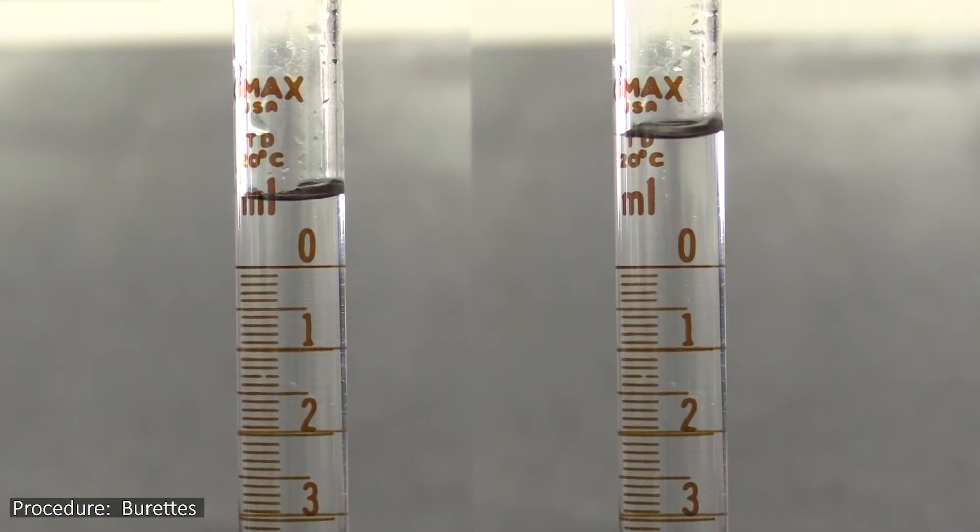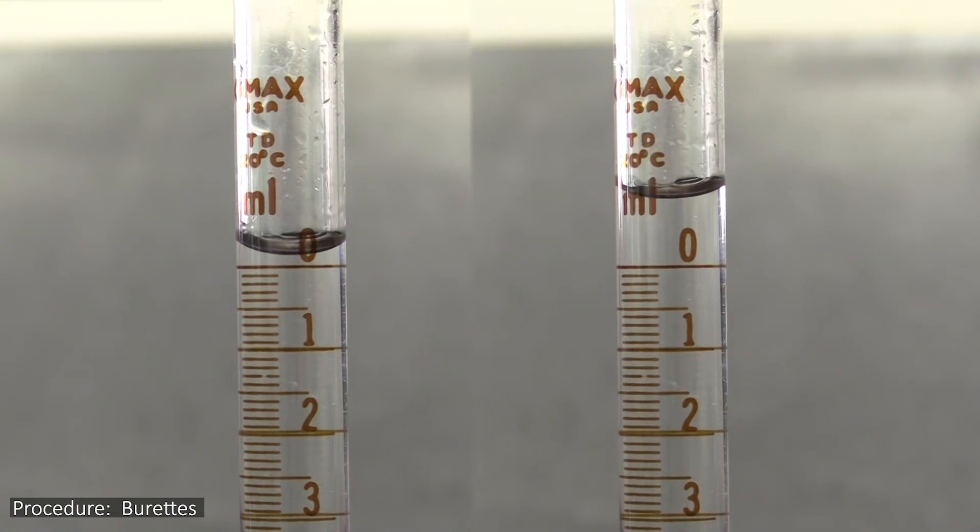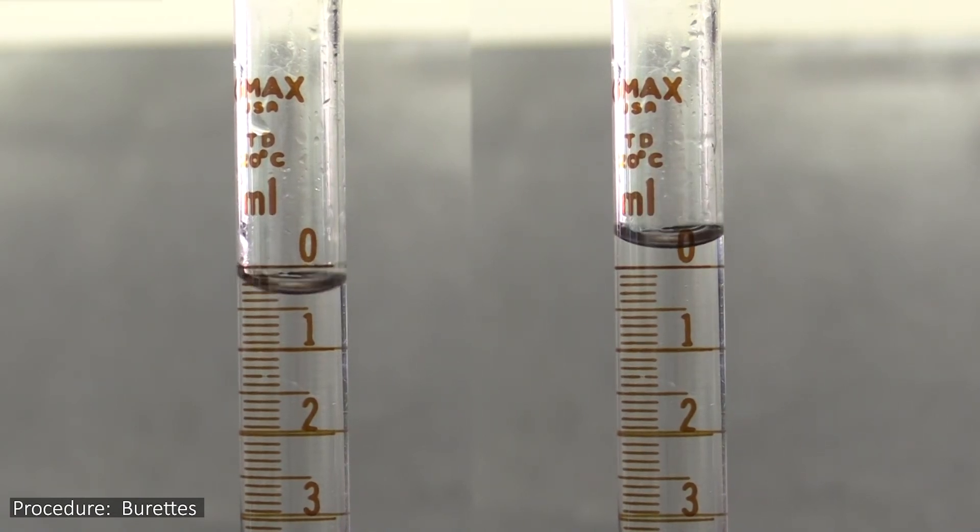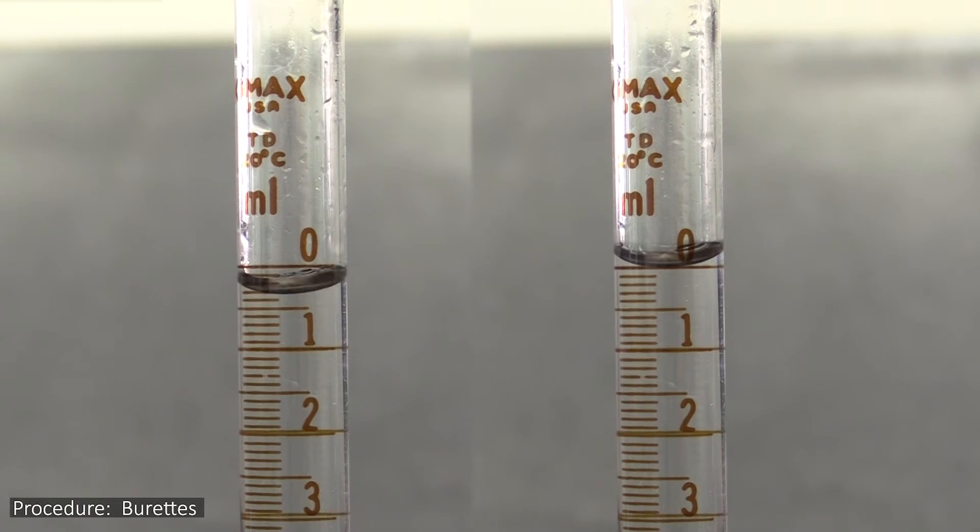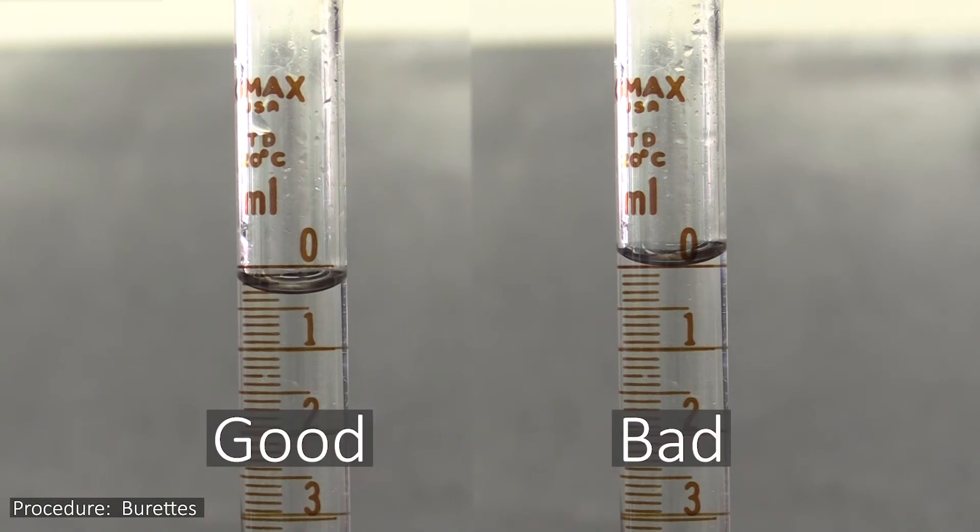Now, let's come back to the other reason why you want to drain the fluid below the 0.00 mL mark and not to it. The second reason is because it is hard, and time-consuming, to get the meniscus down to exactly 0.00, to the point that, for all intents and purposes, it doesn't happen. So if you are truly reading the meniscus properly, you won't have any 0.00 mL readings.